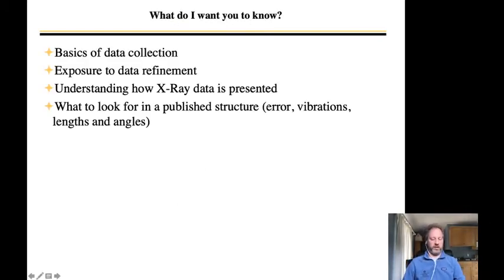Okay, so basics of data collection. That's the first thing that I would like you to know. I'll give you some information on how to collect X-ray data. This would be a part of the course where we would be using the new Mini in the lab a little bit. I was hoping to show you the guts of that and maybe do a couple tutorials, but obviously that's not happening. Data refinement, what does that mean?